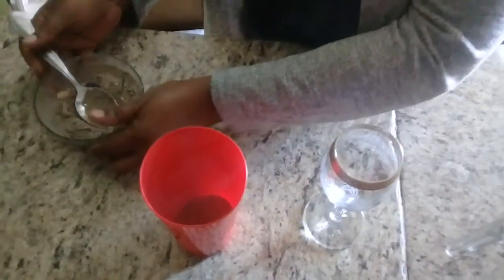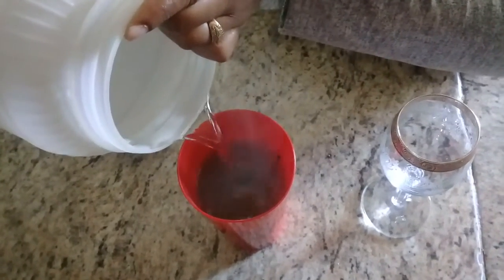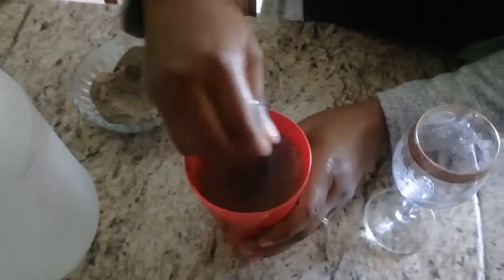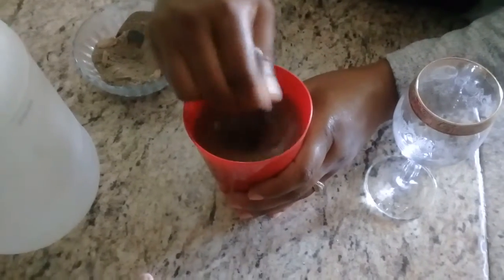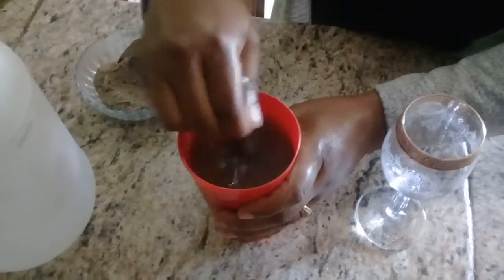Next, I am going to add water to the container. I add my water to the container and I mix my sand and water. Remember, we are trying to separate the liquid from the solid. So I'm mixing it, mixing, and mixing.